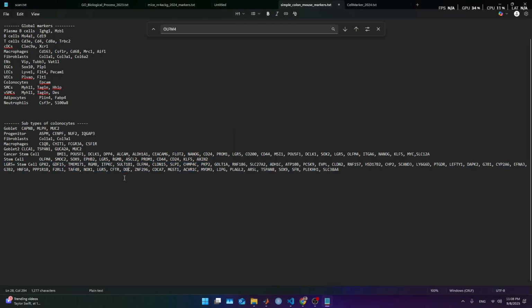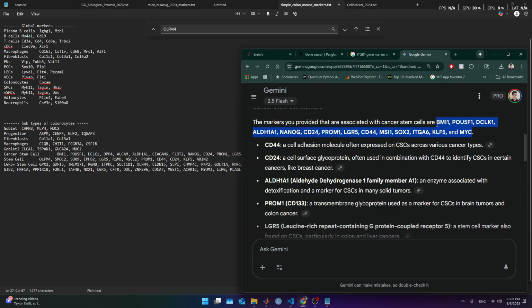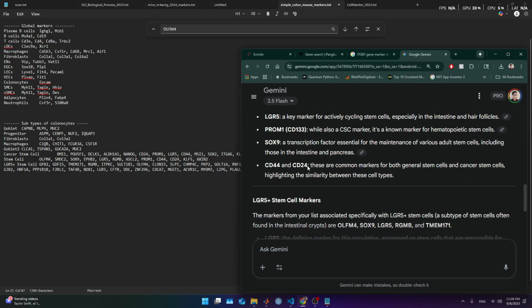for just stem cells. Just stem cells. I'm feeling lazy at this point, so it didn't change. And we're gonna grab this for cancer because many of these are not correct. Let's see if that reduces. Yeah, it did. Good. And in theory, it's getting better.